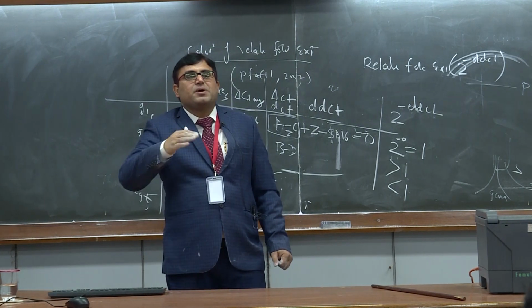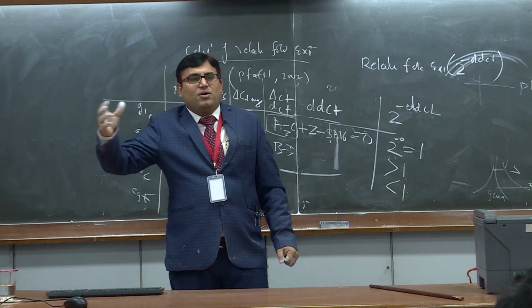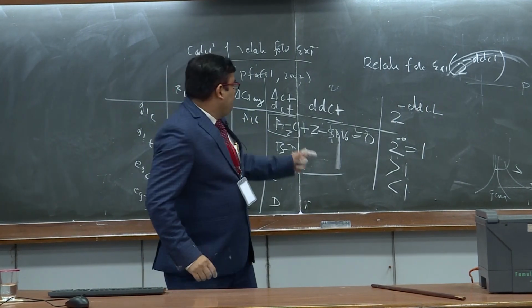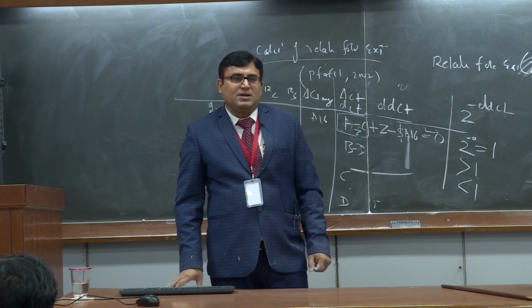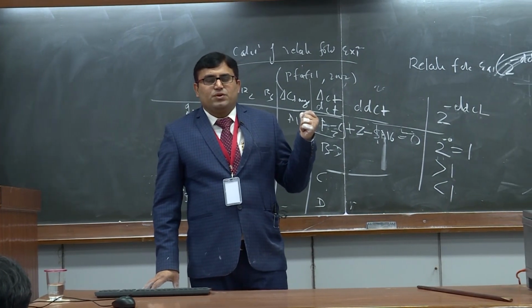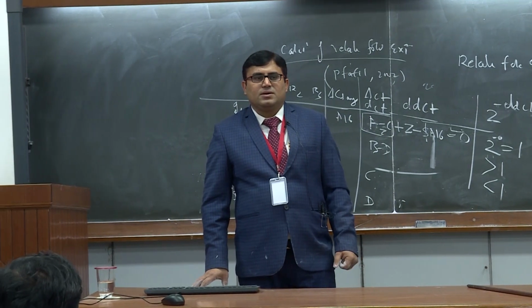It means, in comparison to 1, what was the fate of the treatment on the expression of the gene you are targeting. When you feed this formula into Excel and drag it in one go, it will give you the result. So this was the method discovered by Pfaffl, and we also call it the Pfaffl method.